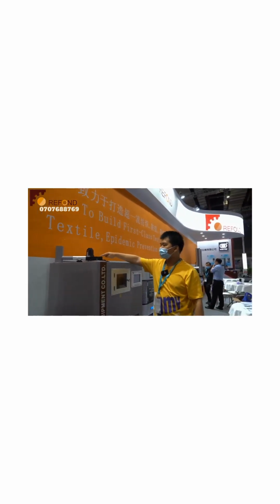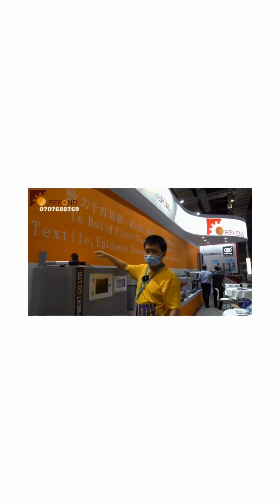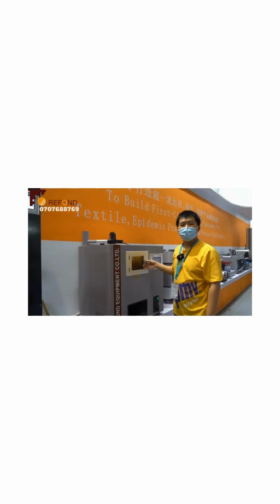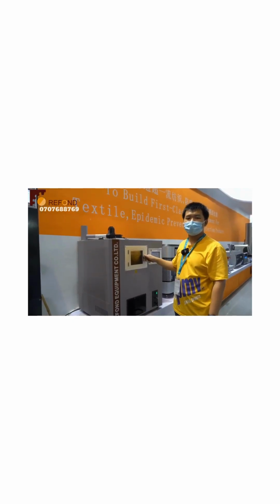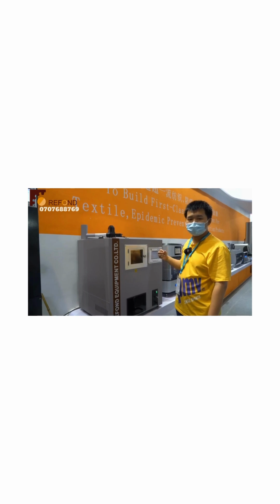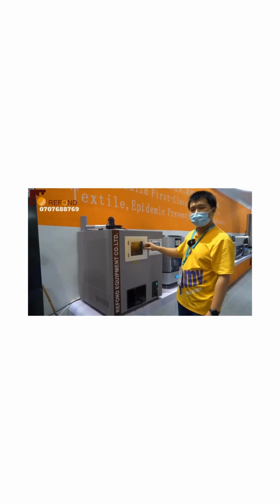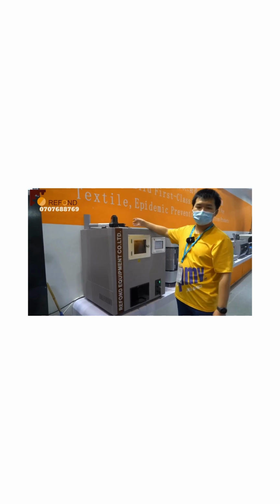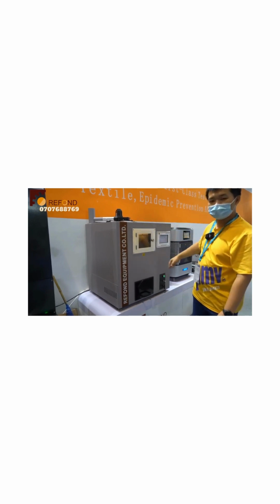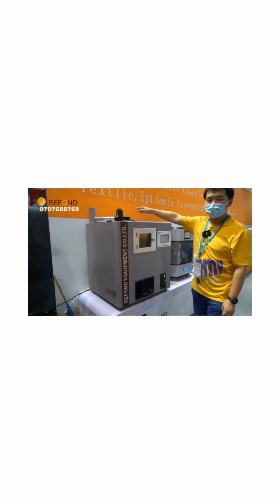And at the top of this machine, you will see a big exhaust fan. This exhaust fan will exhaust all the air out whenever you stop or pause the test. And this door is also magnetically locked after the test for a period of time. So this is to prevent the harmful gas inside from getting out accidentally if you stop the test. After the test, the door will remain locked for 30 seconds for the exhaust fan to exhaust all the gas inside. You should put this machine in a well-ventilated area and also connect the exhaust pipe here at the top of the machine.